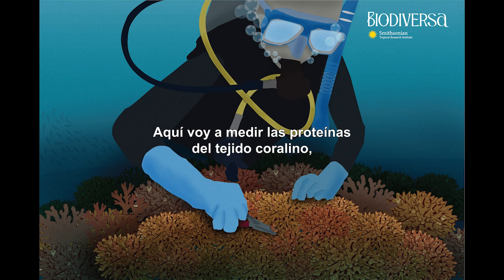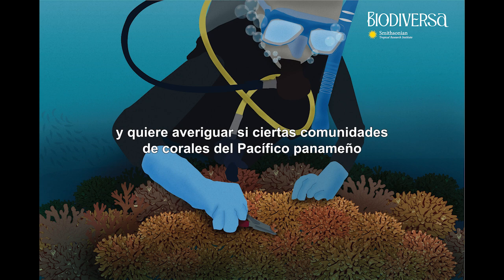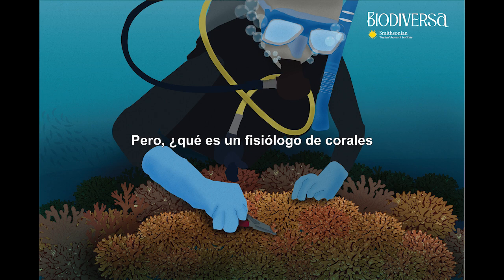Here I'm going to measure proteins in coral tissues, because this is a good way to find out if they are healthy or not. Laura is a Brazilian coral physiologist and she wants to find out whether certain coral communities in the Panamanian Pacific have developed immunity to climate change. Measuring the protein in the coral tissue is just one of the methods she's using to answer this question.